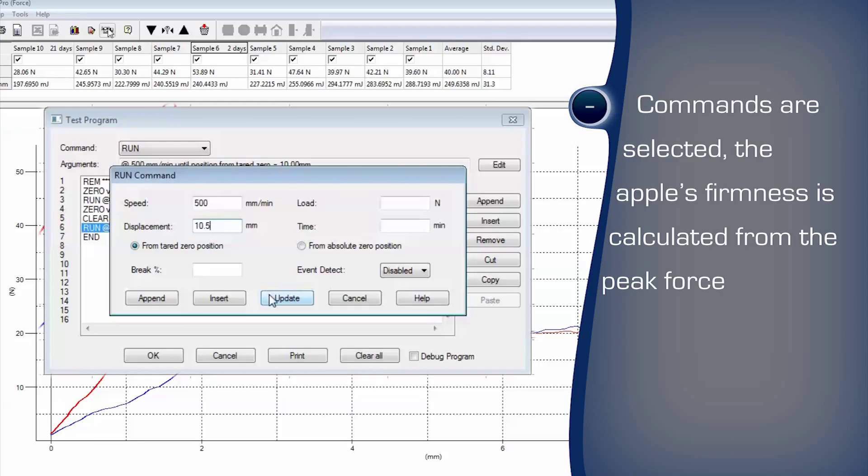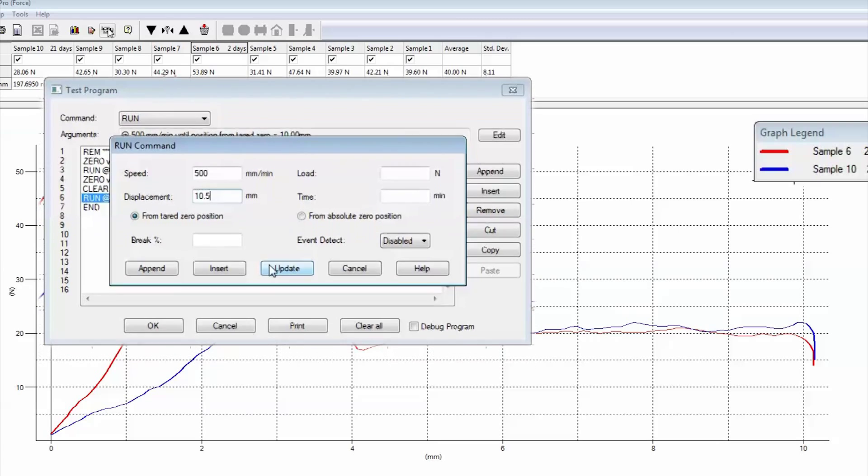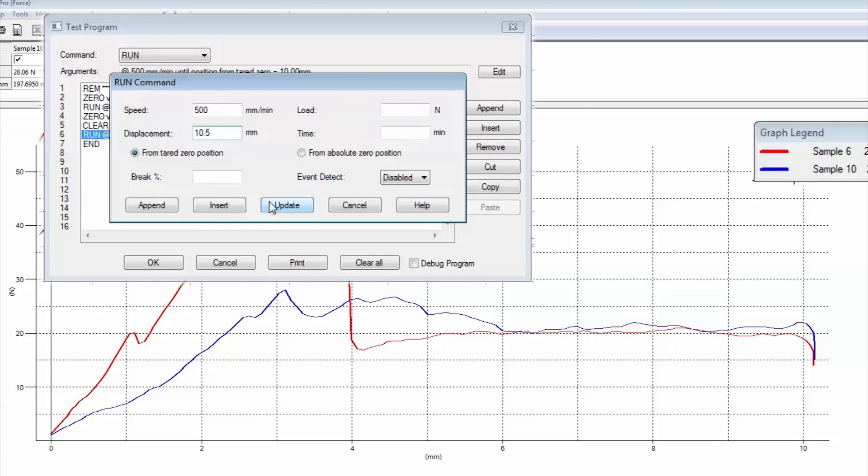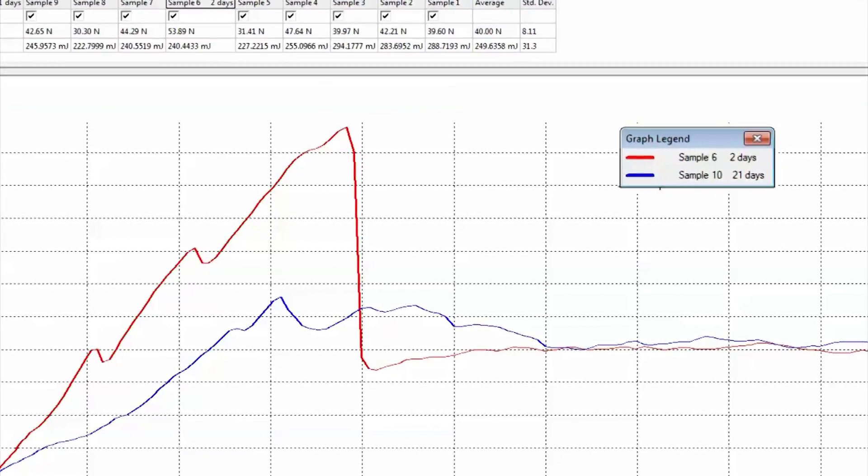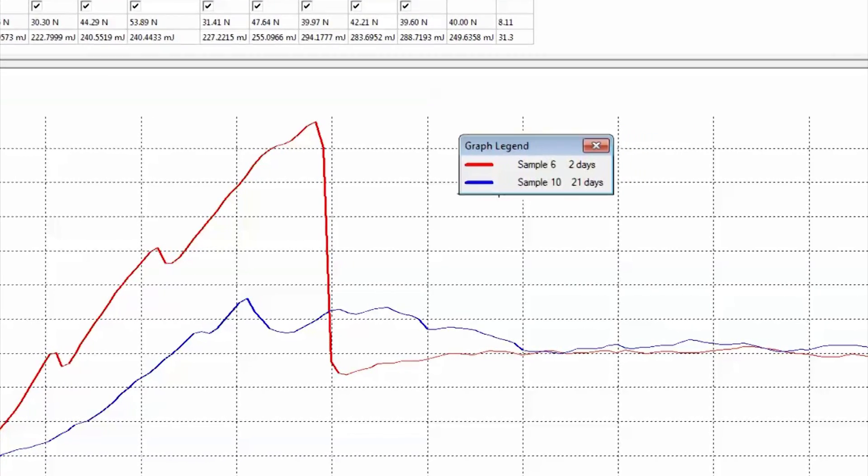And the work required to complete the penetration into the fruit for 10mm is also calculated from the area below the force distance curve. These two values will give greater information about the texture to more closely compare to samples and provide even more feedback relevant to the quality of the produce.